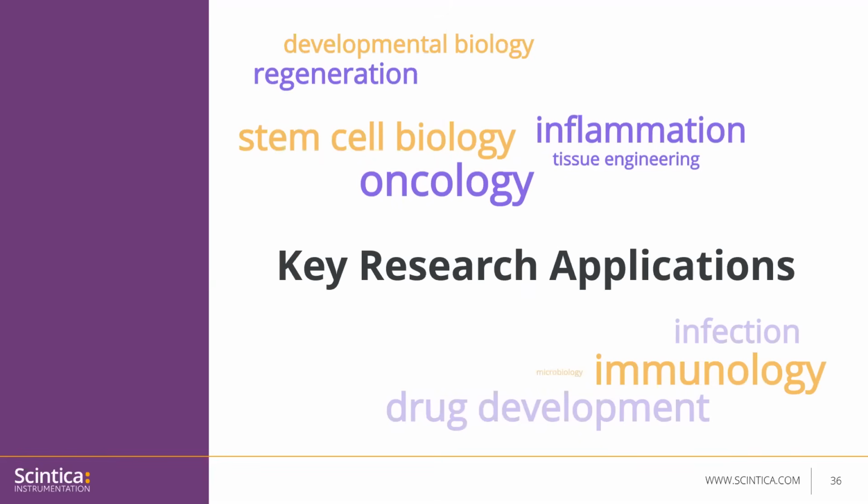I'll now be showing some confocal microscopy intravital images of some key research applications. In general, intravital microscopy is most often applied in oncology and immunology research, but also often in order to unravel stem cell biology and characterize drug development.